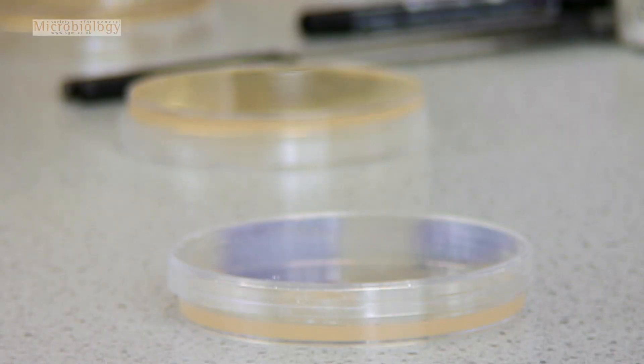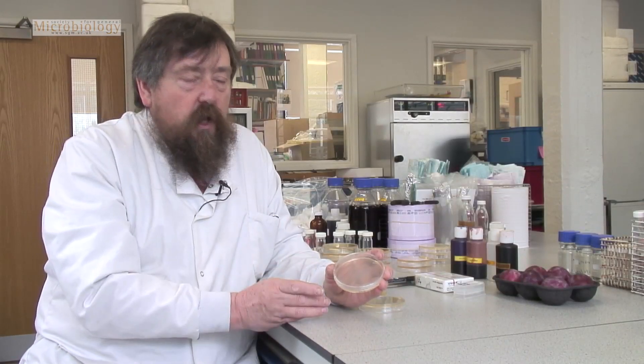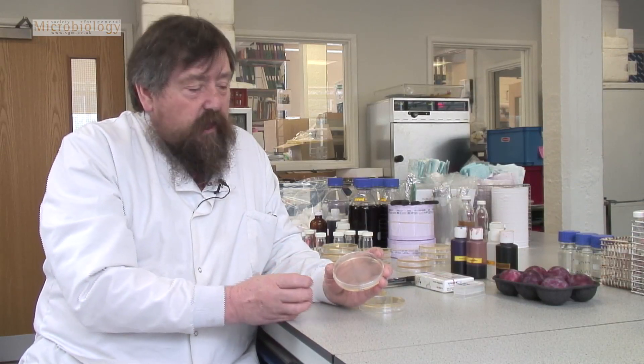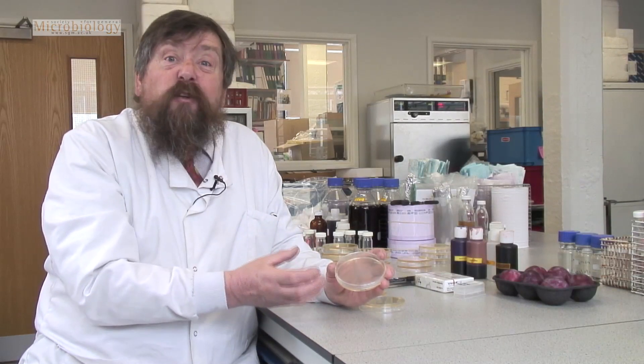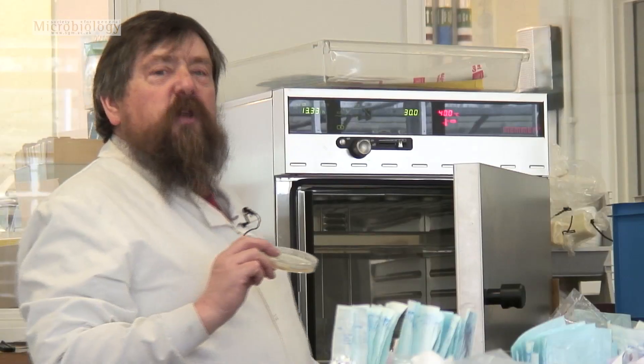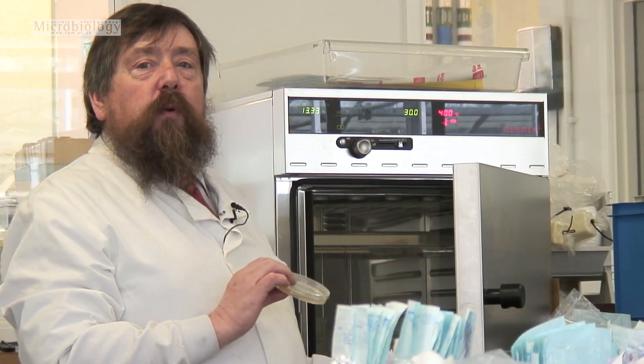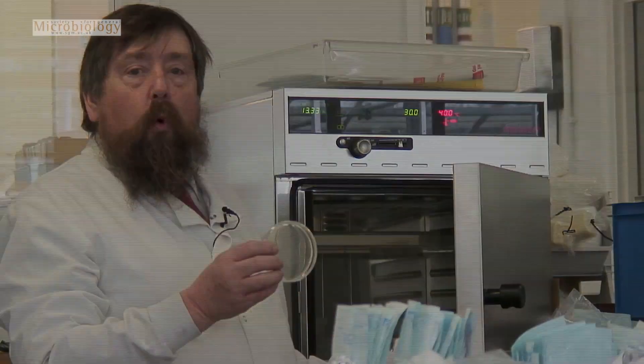This jelly contains food that will make the yeast cells grow, but this takes time, so what we need to do is to encourage the cells to grow. We're going to put it in the warm and leave it there for one to two days. This is called an incubator and it's just a heater — it will keep the microorganisms nice and warm.